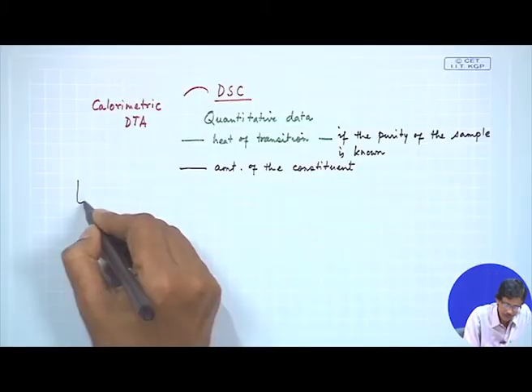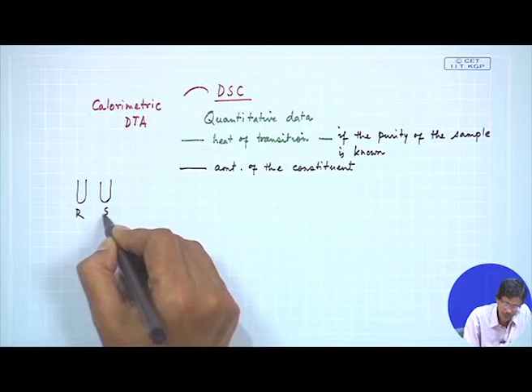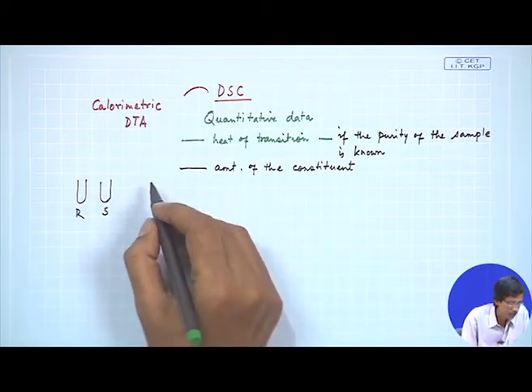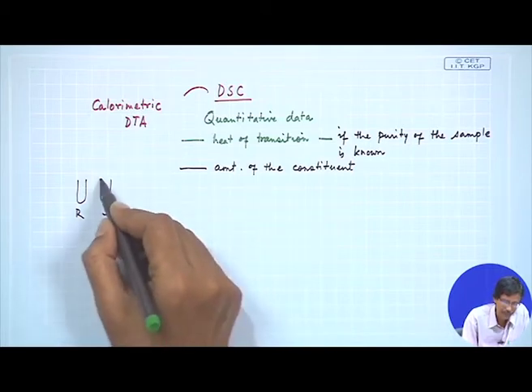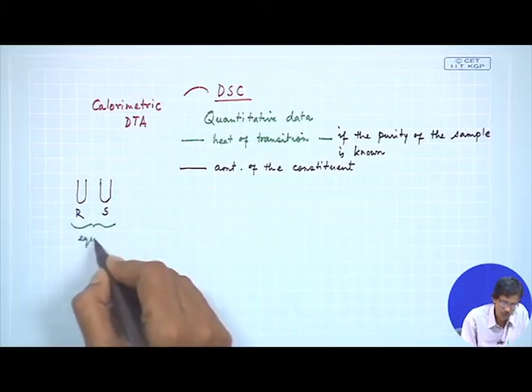So, in this DSC instrument, we have the differential of the corresponding energy to heat the sample or the reference, because these two, the sample and the reference, we want to keep the two temperatures in equality. So, very close. So, if you have the reference as we saw just now and the sample, so we have R and S, and we want to keep them to a very small temperature difference, or the amount of power required, because one can be cold and another can be heated up. So, the two temperatures should be kept very close to equality.